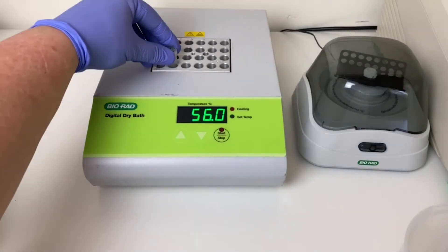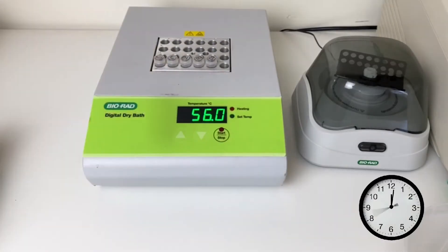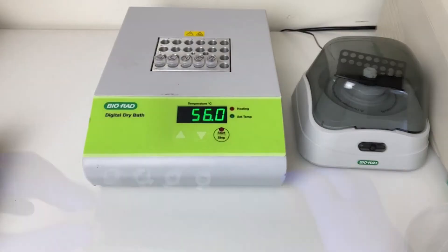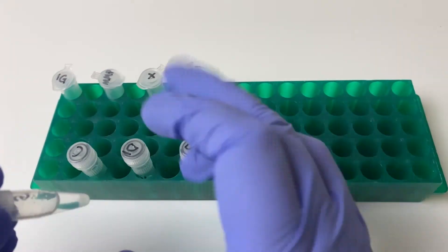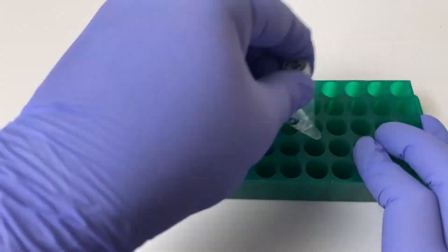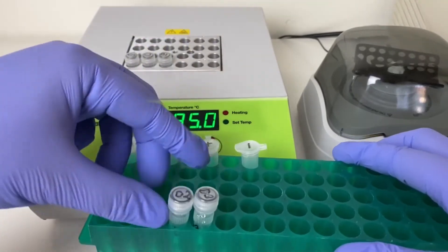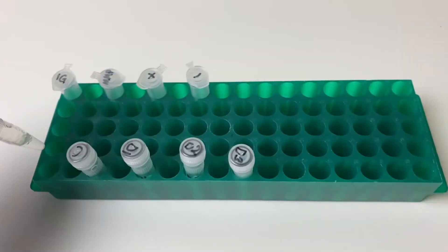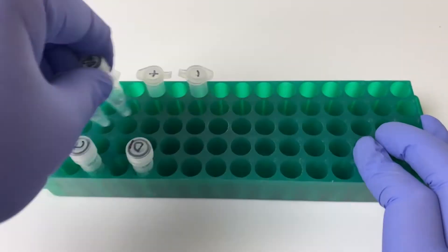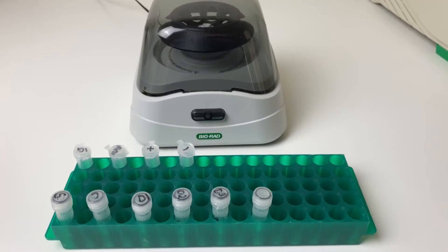Incubate the tubes in a dry bath or water bath for 15 minutes at 56 degrees Celsius. Then transfer the tubes to a dry bath or water bath set to 95 degrees Celsius for 8 minutes. Let them cool slightly, then flick or vortex the tubes to mix. At this point you can stop and store your samples in the fridge, or continue on.